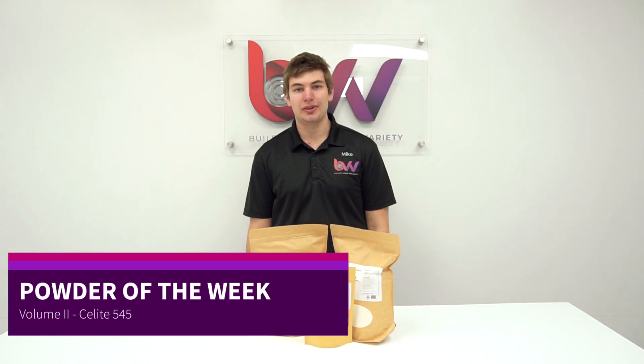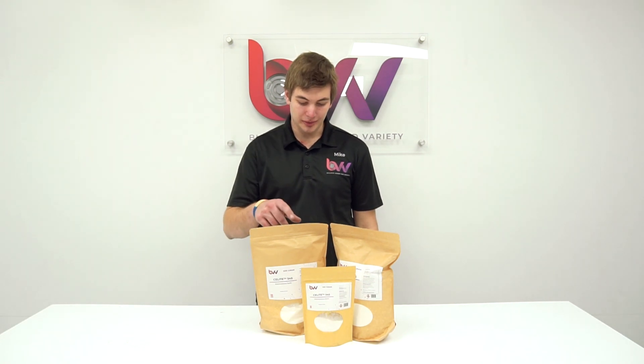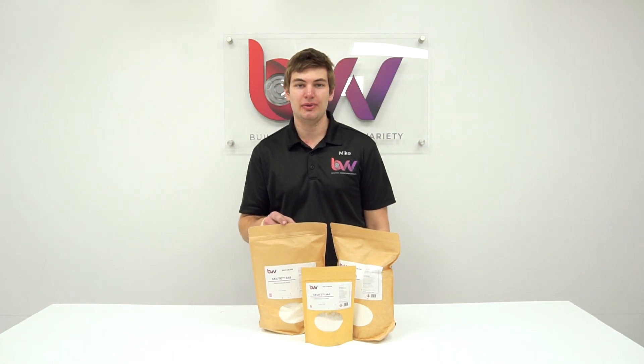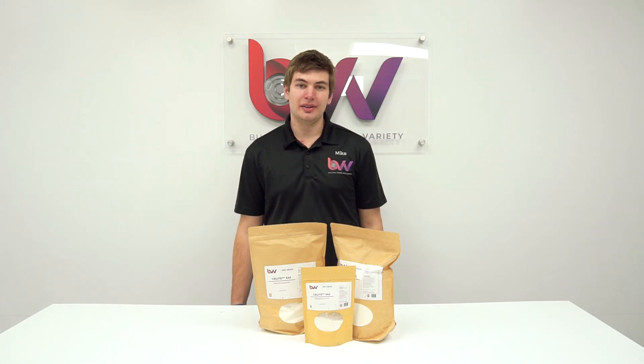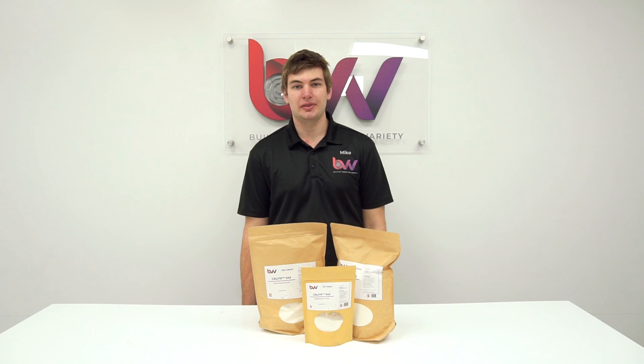Hi everyone, we're here with Powder of the Week Volume 2. Today we have this Celite 545, also known as diatomaceous earth. This stuff is used for filtration. A lot of times you're going to use this in conjunction with your activated carbon.